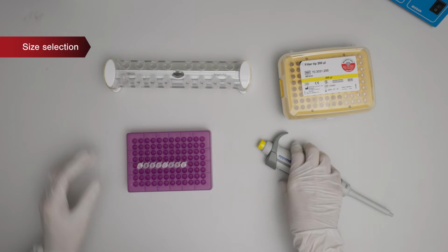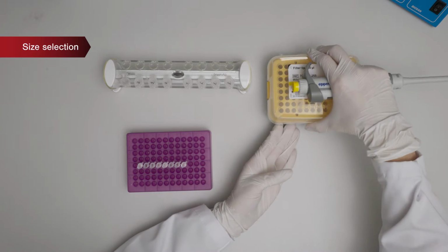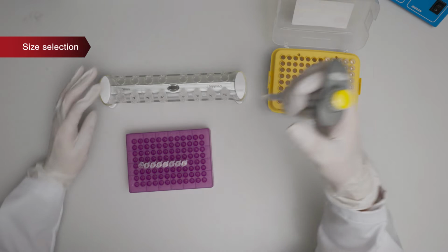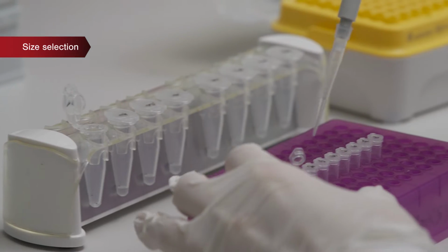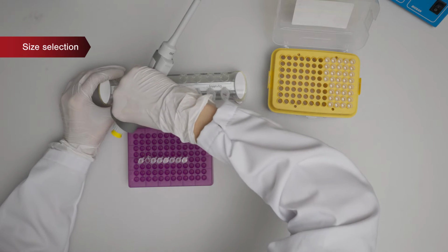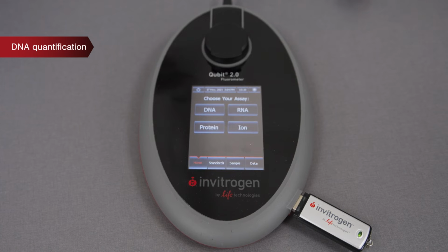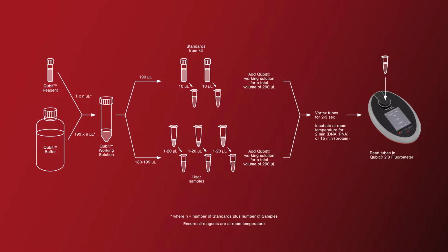Take into account that during the double size selection, 60 to 95% of initial DNA in the sample is usually lost. After this step, it's important to normalize the amount of DNA so that all samples would have the same input for the next step. Concentration of each sample is measured using Qubit fluorometer and high-sensitivity double-stranded DNA assay kit.